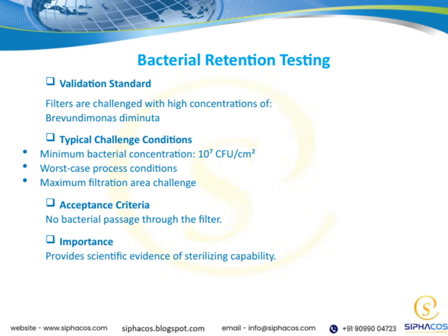The typical challenge conditions involve exposing the filter to a minimum bacterial concentration of 10^7 CFU per square centimeter, representing a very rigorous test scenario. We also simulate worst-case process conditions and maximum filtration area challenges to ensure the filter's robustness under the most demanding circumstances.